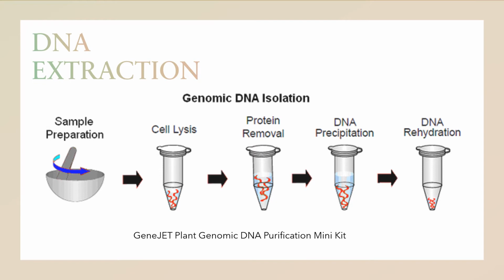Depending on the mechanical method that we use in order to grind our sample, it can either be in a dry or wet form. So if we use liquid nitrogen, it usually will turn into a dry powdery form, but within a minute it will turn wet after the liquid nitrogen has dissipated. So we grind them into powder form, or if we use ethanol, we break the plant sample in ethanol in a wet form.